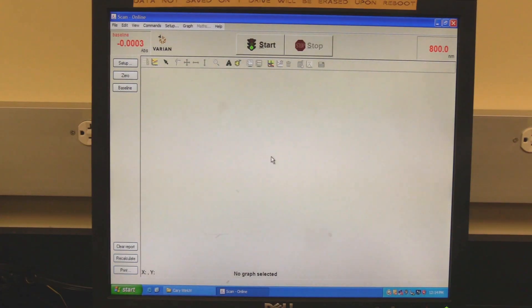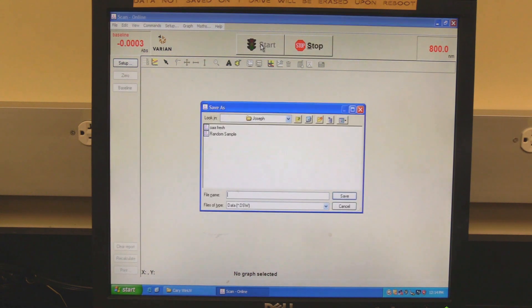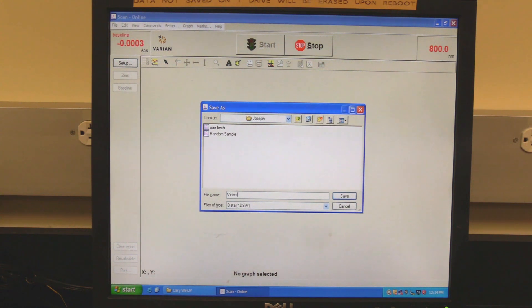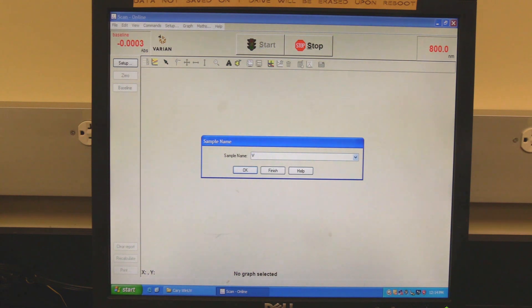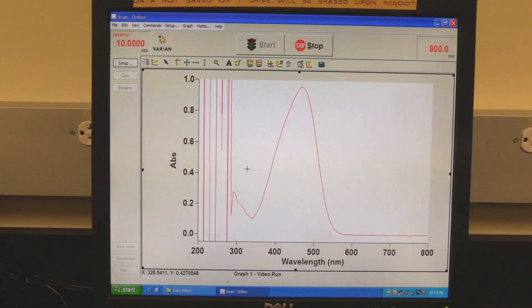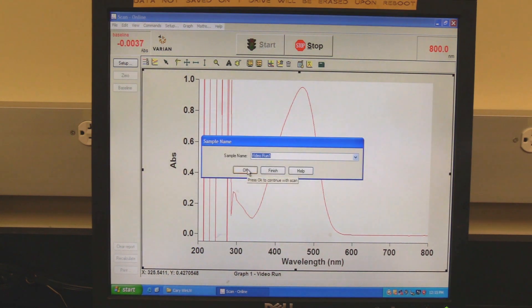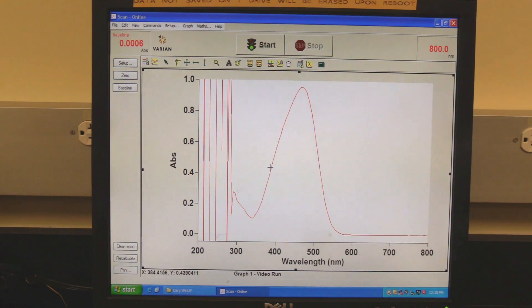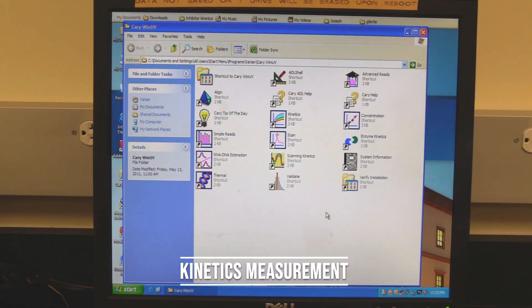Replace the blank cuvette with the sample cuvette and close the lid. Click on the Start button. If Save at Start was selected, the software will prompt the operator to save. Find the appropriate folder, name the file, and click Save. The software will prompt for the sample name — click OK to start the measurement. Wait for the measurement to finish; the spectrum will appear. The software will prompt for the next sample name. If measuring another sample, click OK; if finished, click Finish.